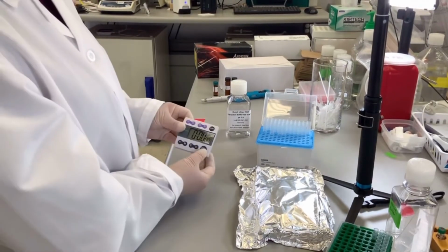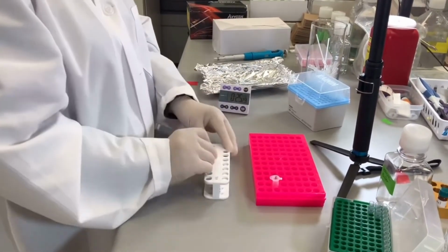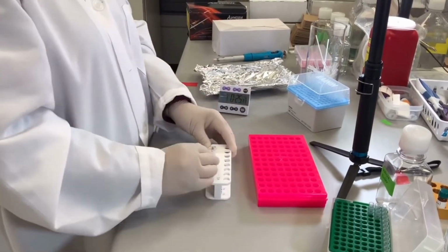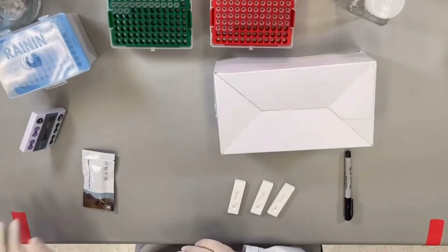At this stage, keep the magnetic rack and any other magnets away to not interfere with the assay. Once 30 minutes has elapsed, place the vials on the magnetic rack for 30 minutes. Protect them from light. Cover with aluminum foil or a box. The nanoparticles will accumulate against the wall of the vial.